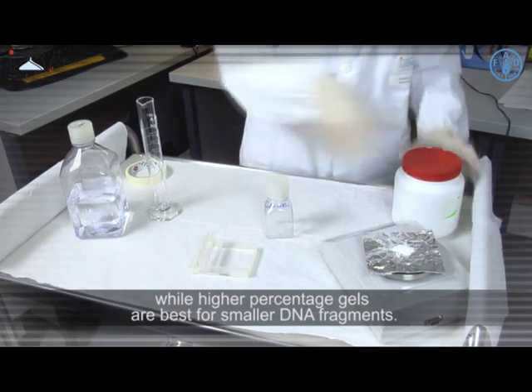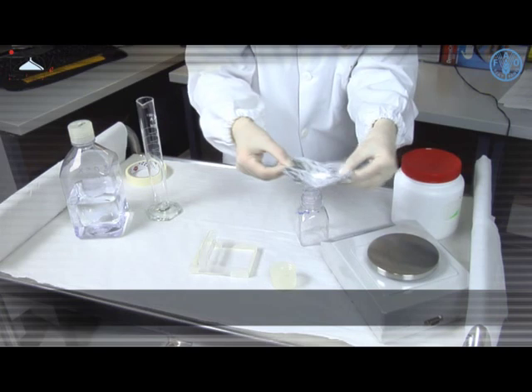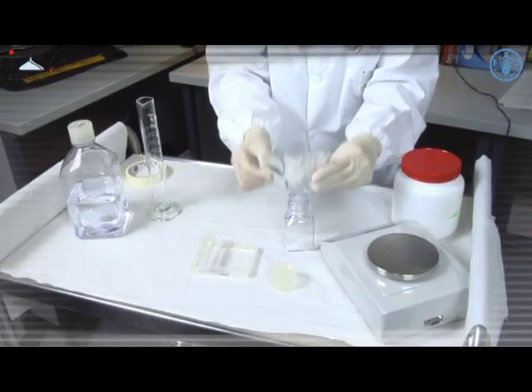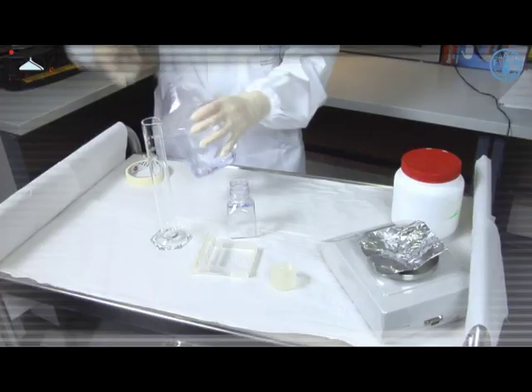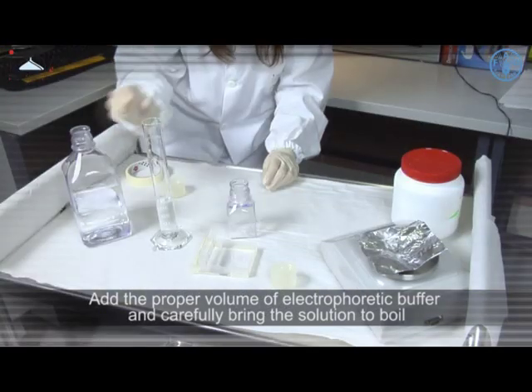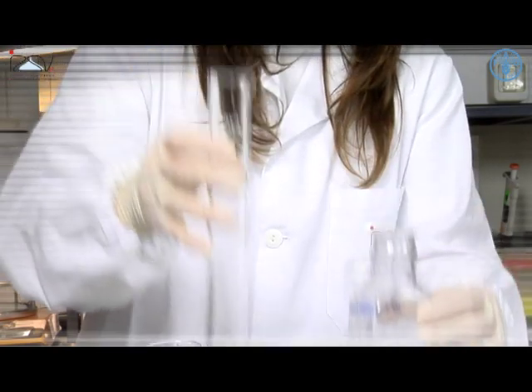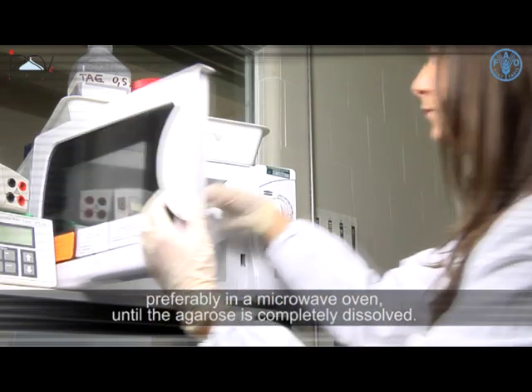For example, low percentage agarose gels are best for the separation of large DNA fragments, while higher percentage gels are best for smaller DNA fragments. Weigh the correct amount of agarose powder to obtain the expected percentage, add the proper volume of electrophoretic buffer, and carefully bring the solution to boil — preferably in a microwave oven — until the agarose is completely dissolved.